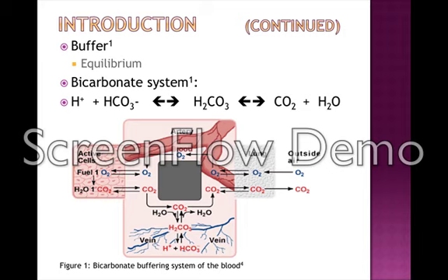equilibrium. Carbonic acid is formed when the carbon dioxide and water mix. Carbonic acid then can dissociate into bicarbonate and hydrogen ions, creating a pH equilibrium. Refer to Figure 1. In this week's lab, we explore the buffering system of the blood by testing the amounts of carbon dioxide we exhale to the amounts of carbon dioxide in the room air. We also examine our own vital lung capacity.